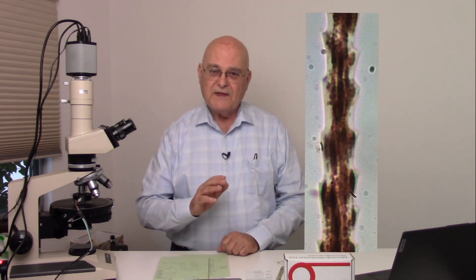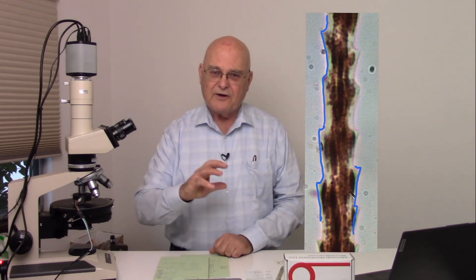And looking at some homes, at times, we might even find bat hair. Bat hair has a unique structure, as you can see. The scale pattern on the outside is very exaggerated with bat hair. So these are some of the things that we can see.